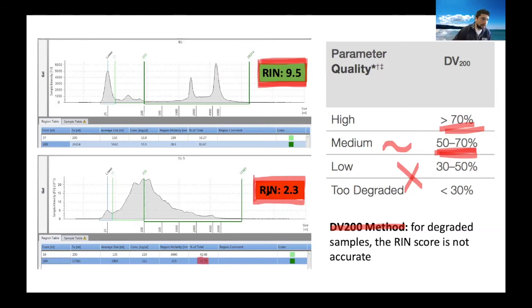I prepared a library using this exact RNA, and we'll discuss later what the best approach is. I used one of the two methods that we already discussed today, called ribosomal depletion. However, the results were not great, and so that's why I switched to a different type of library preparation that we're going to describe in the next slide.